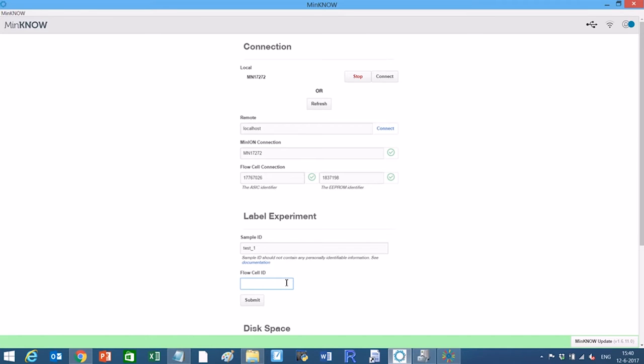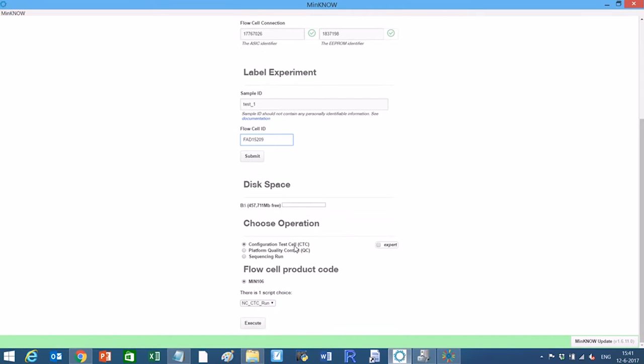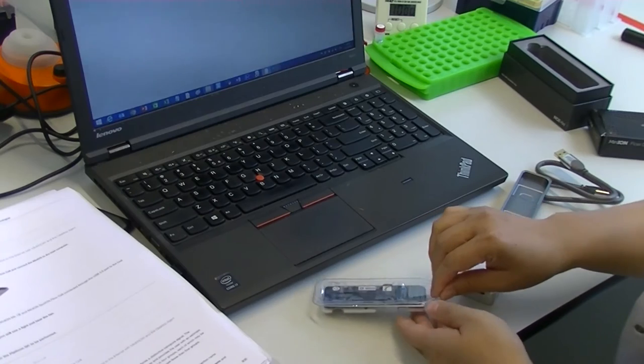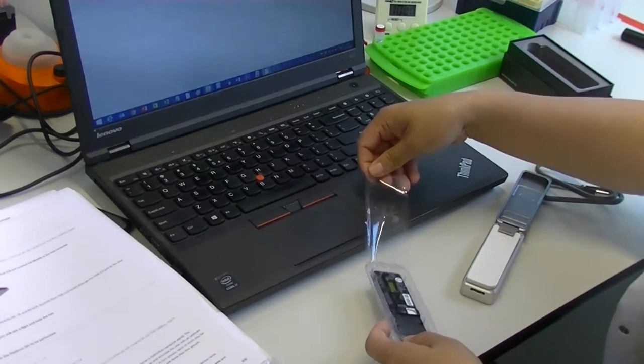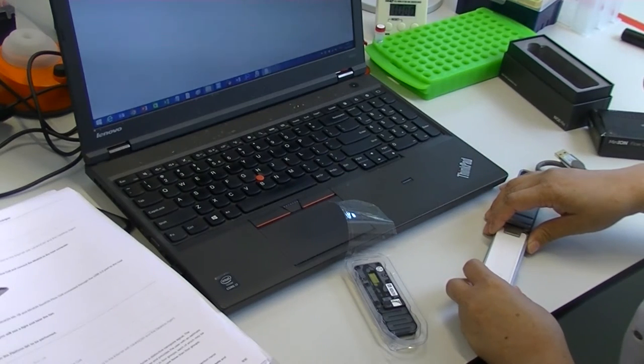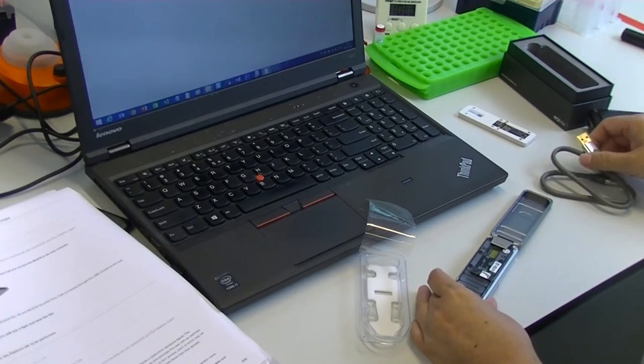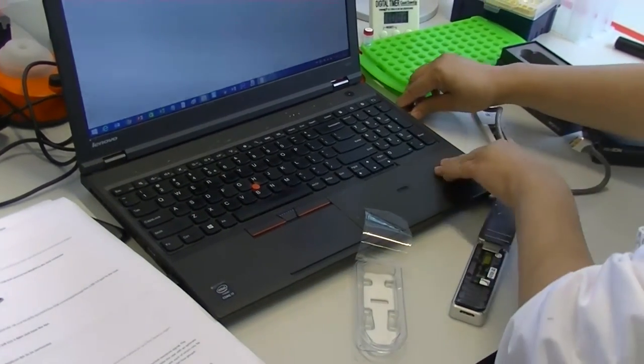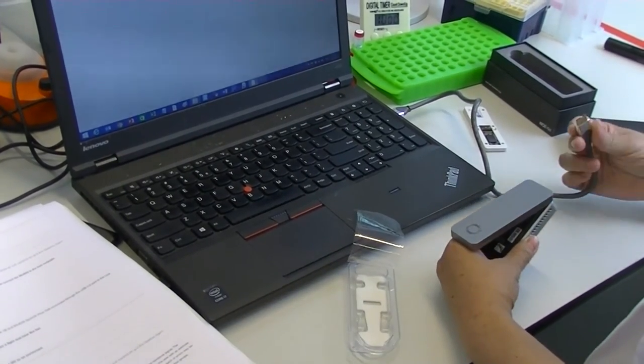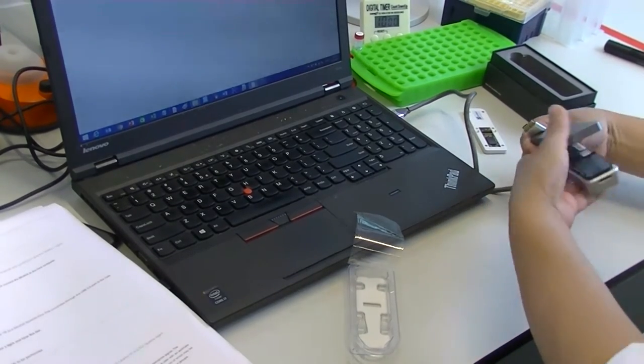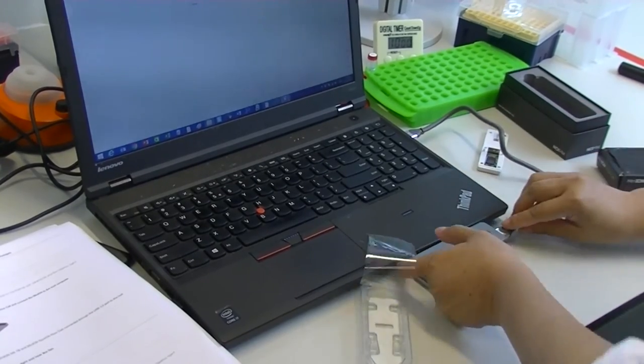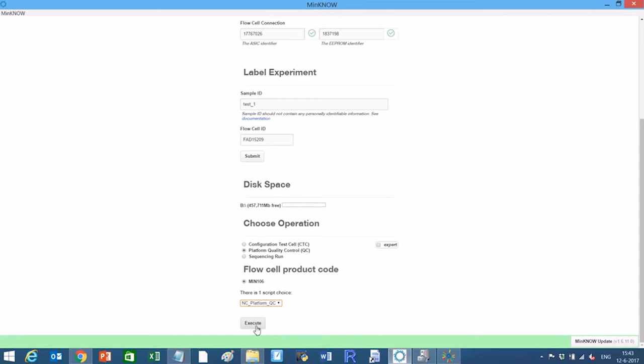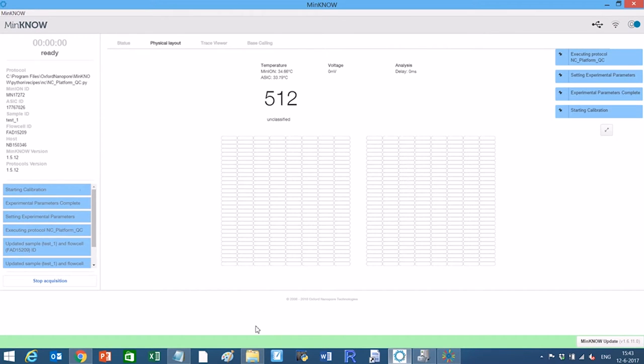Specific parameters need to be filled into the MinIO interface. This will decide the type of sequencing experiment. Assemble the MinION and MinION Spot on flow cells and connect the MinION to the host computer. After assembling the MinION, go back to the MinIO interface and start the experiment.